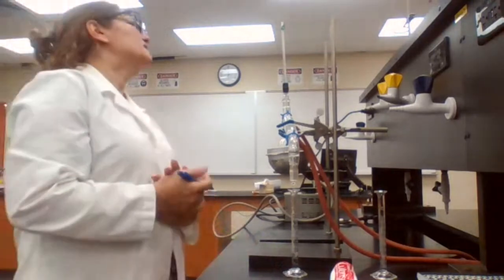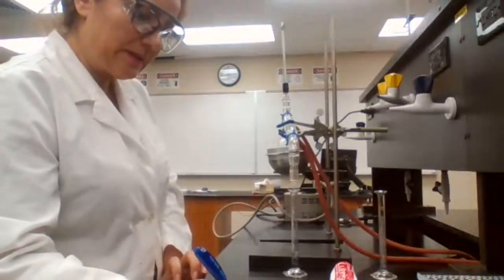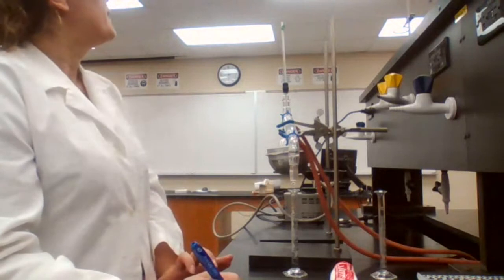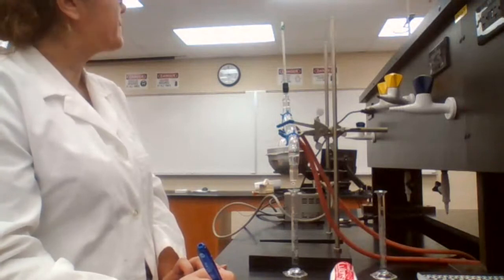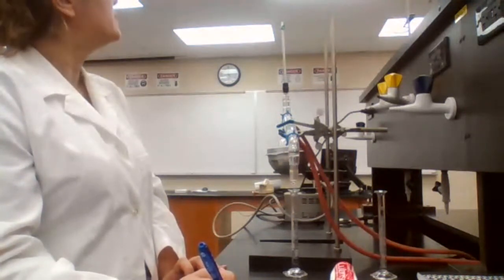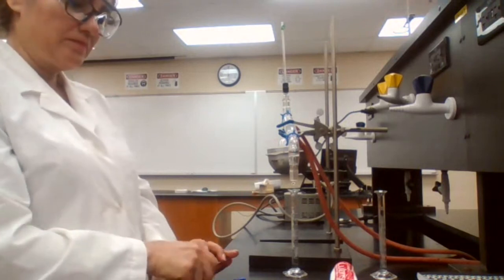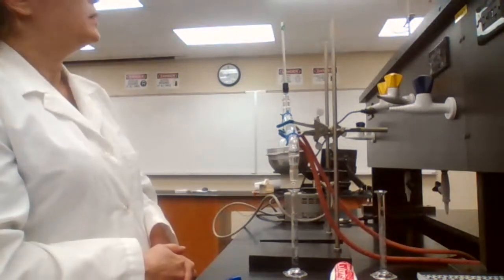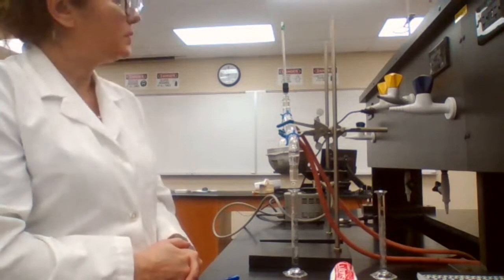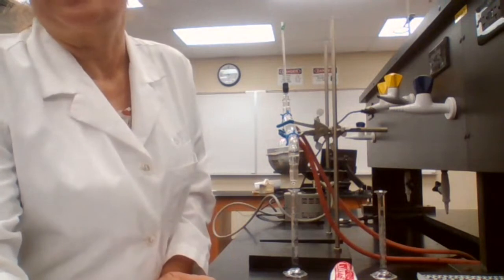Three milliliters, it increased to 60. It moved up again.